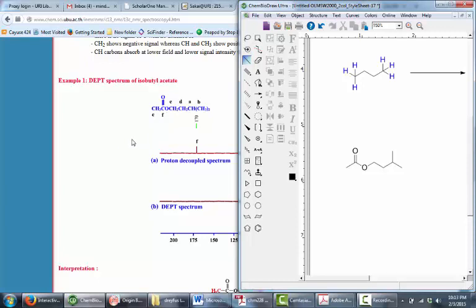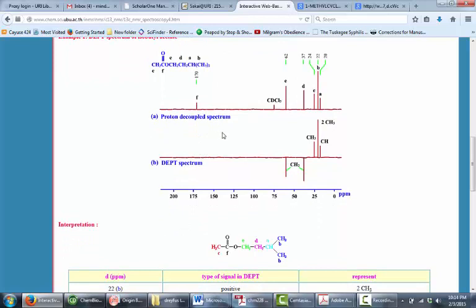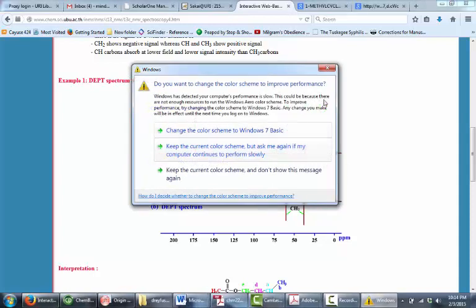And if I just take a regular carbon-13 NMR spectrum, I'm going to see unique signals for each of them. You can see the carbonyl one, that F, is way down here at around 170 ppm, and we've already talked about that. And the one that's closest to the oxygen on the other side, this E carbon, is further deshielded, so this is around 60-ish. And then you have a bunch that are in the normal alkane region. So that's as far as the information you can get from this spectrum.